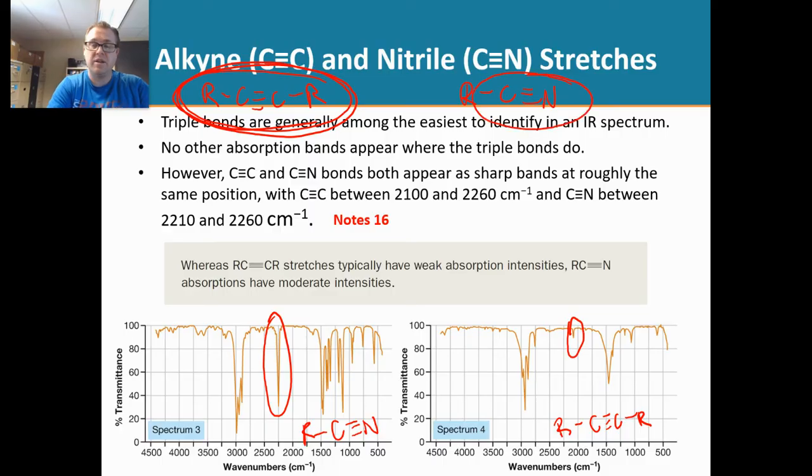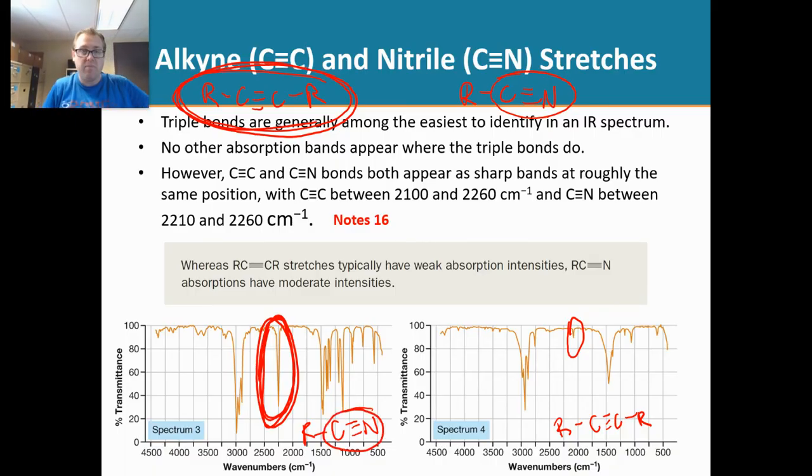But when you look at a nitrile, do you see how there's not really good symmetry? This bond right here is polarized, and the more polar a molecule is, the more intense the signal is going to be. That is why you see this really intense peak right there for the nitrile because of that polarization.